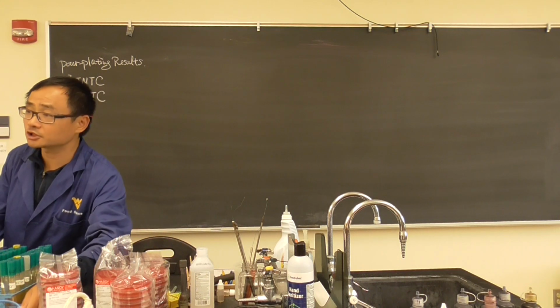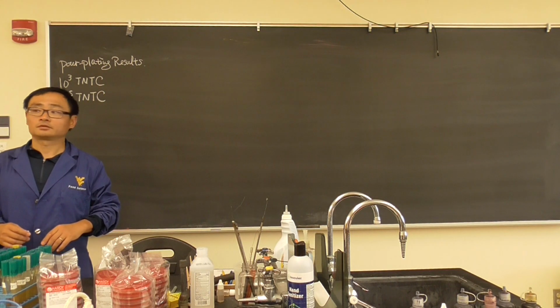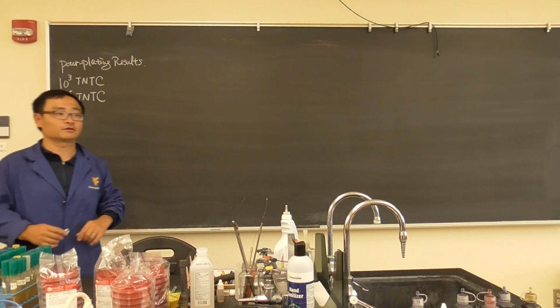Okay, that's very interesting experiences. Is that meddling? Yeah. Please go ahead to count instead of laughing, okay?